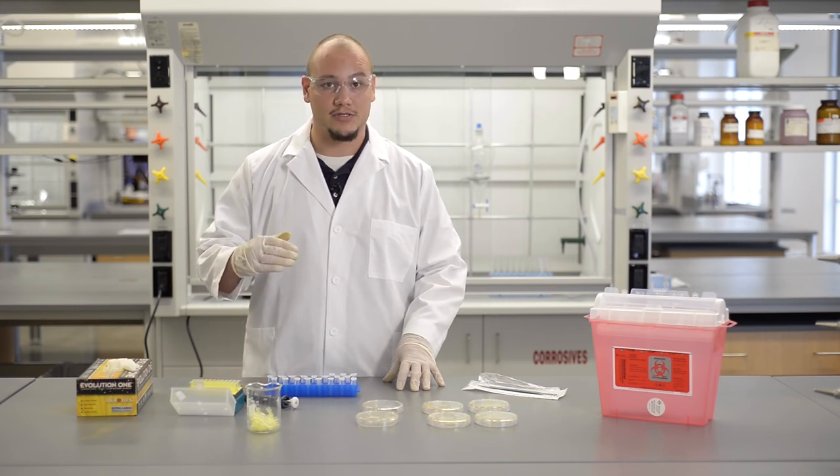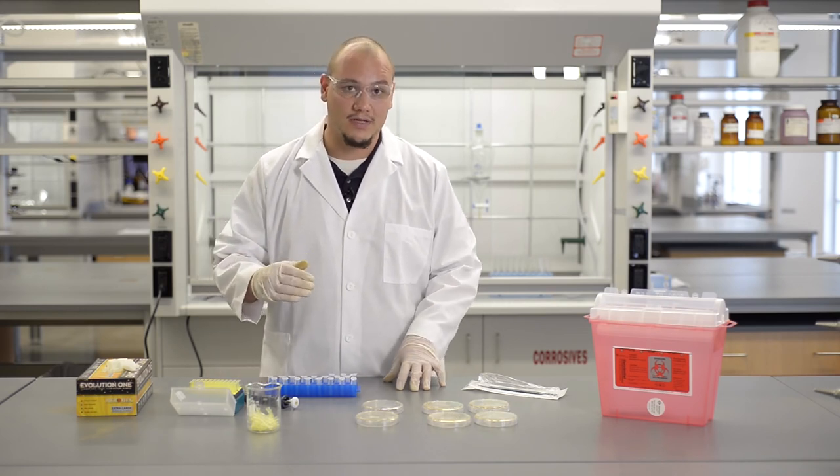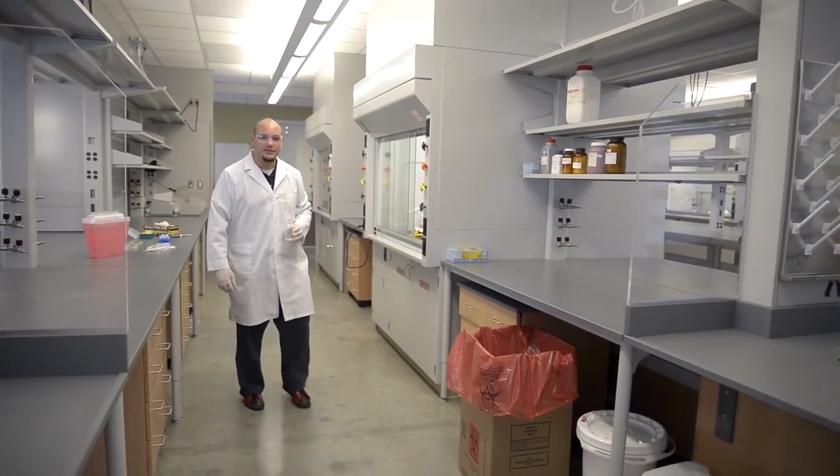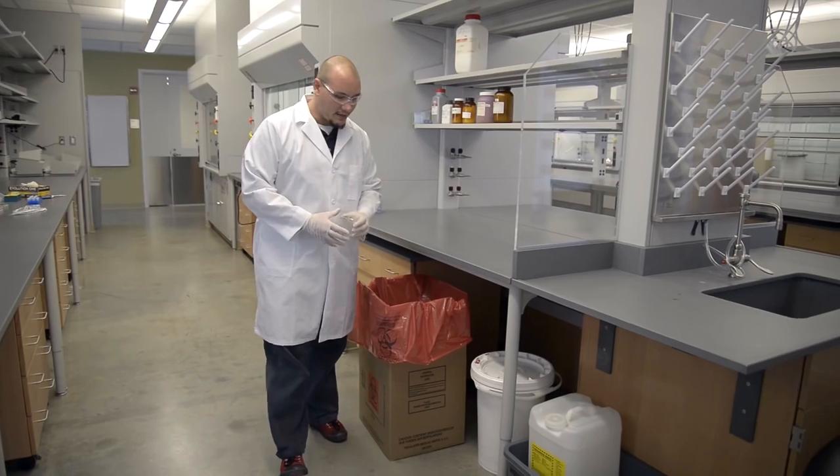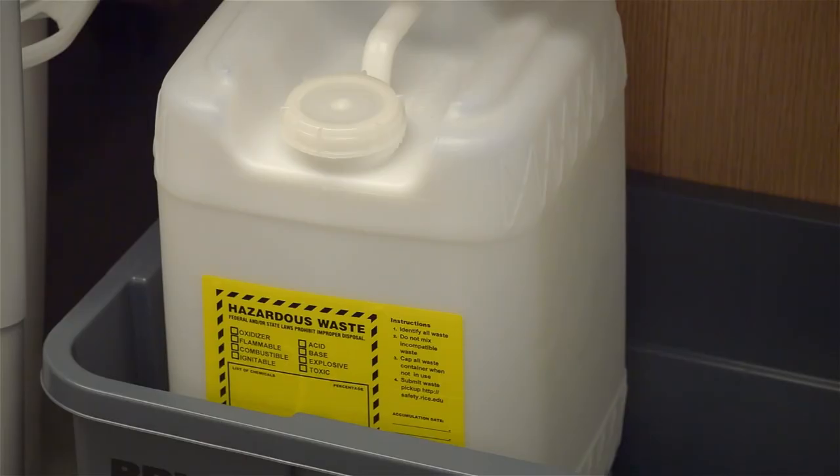This means taking measures to protect yourself, other people, as well as the environment. Whenever working with biological materials, make sure to throw them away in an appropriate biohazardous waste container. If you're only working with chemicals, throw them away in a hazardous waste container.